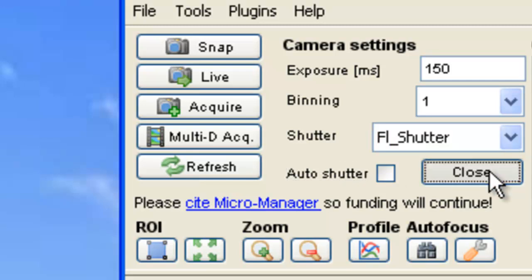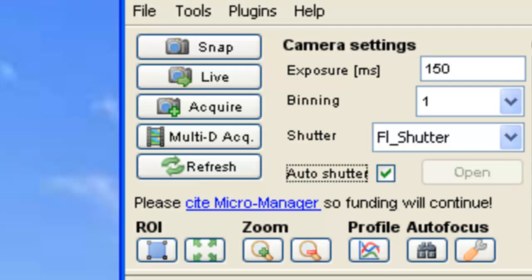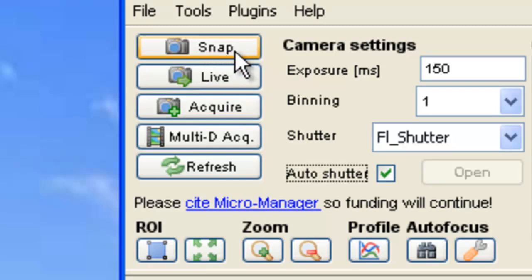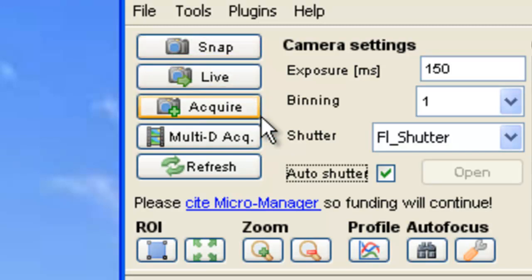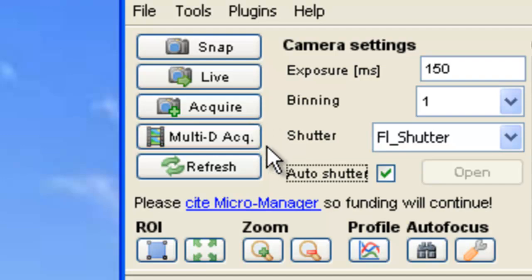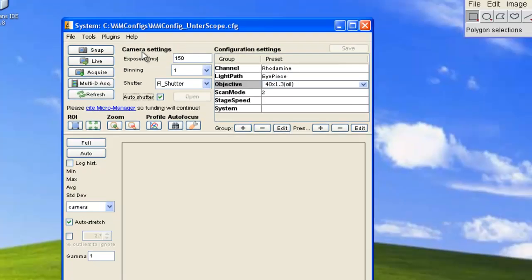You can also choose to open and close the shutter manually. To the left of the camera settings, we have the option to snap an image, view a live acquisition, acquire an image, start the multi-dimensional acquisition engine, or if need be, refresh MicroManager.